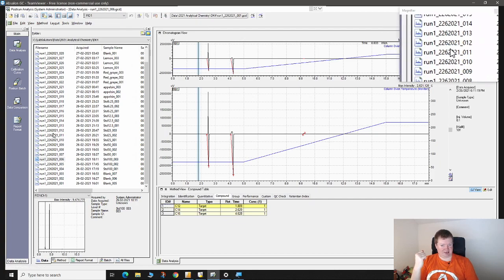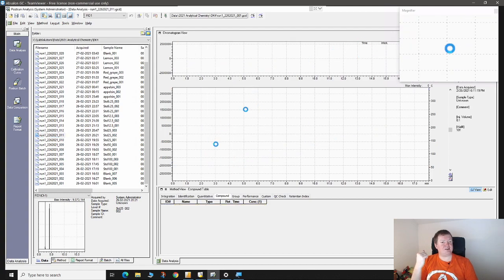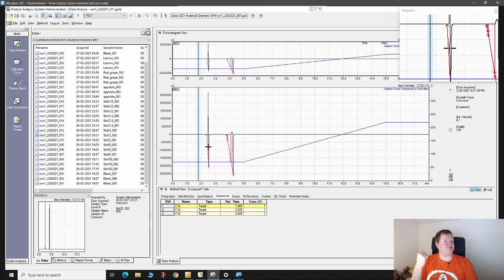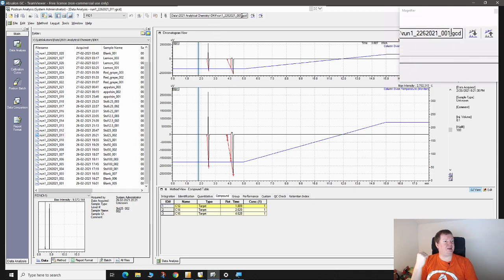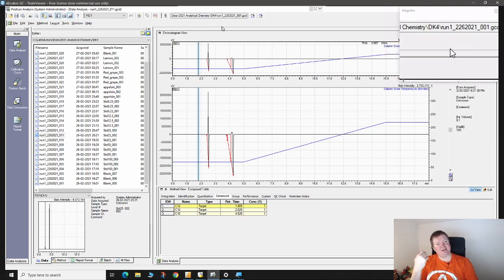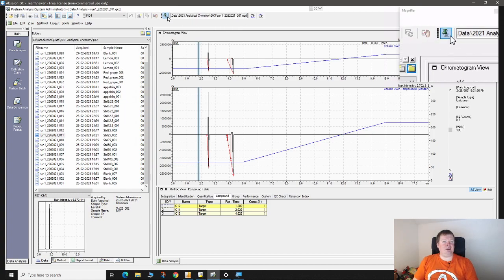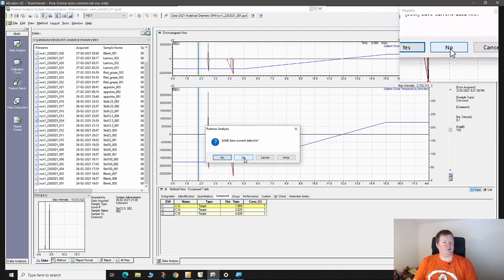And what that means is now if I open a different data file, I don't want to save any data, don't want to mess it up for them, you can see that it automatically subtracts the same blank sample. So that makes it a bit easier for you to actually deal with this. Now, for the export of data, that's actually what you're interested in.